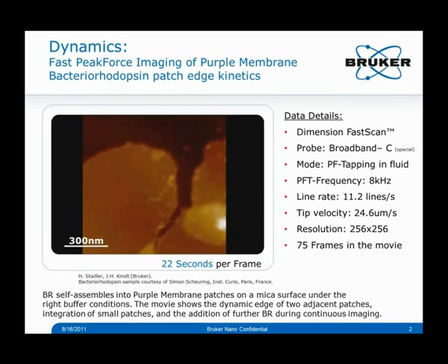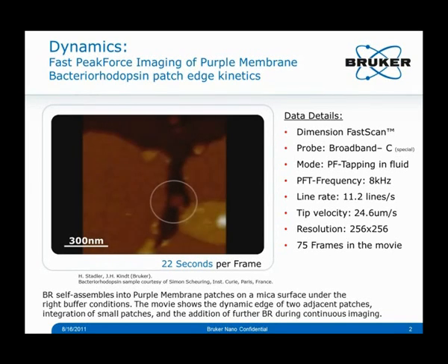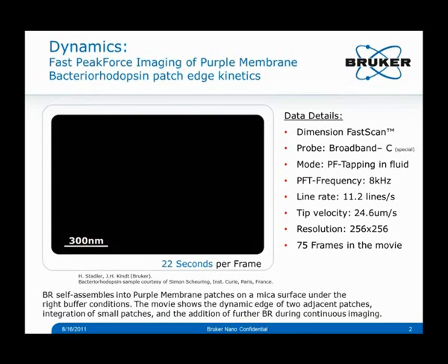In the caption under the image it says purple membrane patches on a mica surface self-assemble under the right buffer conditions. Now, in case you have customers who ask what those right buffer conditions might be, I put a little note into the slide notes for you.